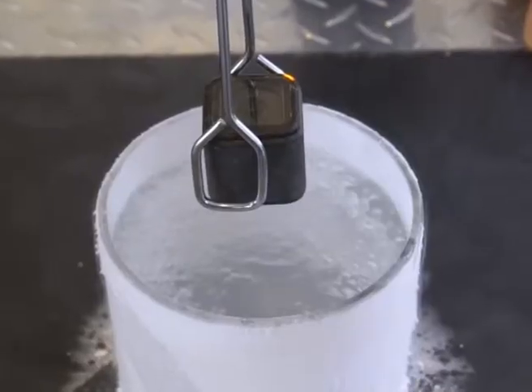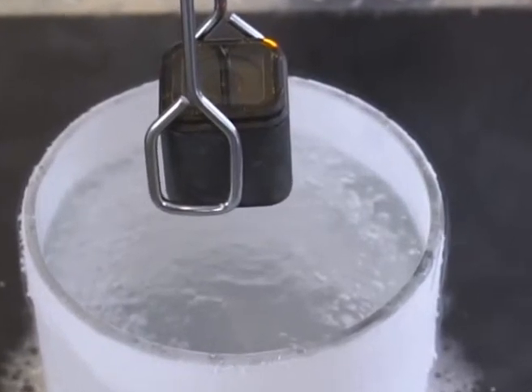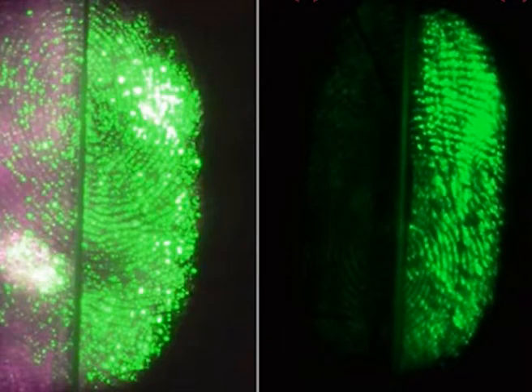After the solvents evaporate, the sample is dipped in liquid nitrogen so as to bring down the temperature to -200°C. When examined under an arc lamp, intense fluorescence is produced. A xenon lamp is the most common source for illuminating prints developed by ninhydrin and post-treated by zinc chloride. A Watkins indium lamp, a Kent's quasar lamp or a unilight lamp may also be used for illuminating the finger marks.